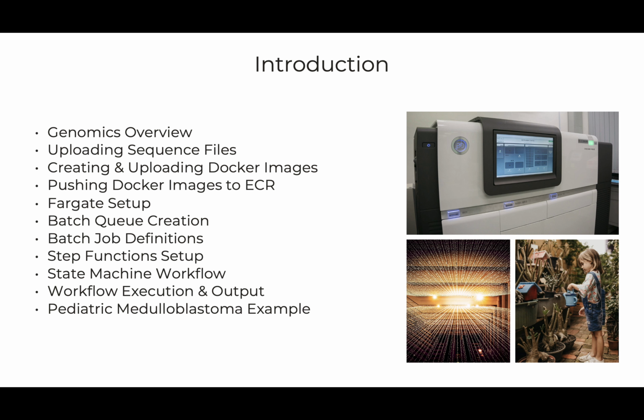These files are vital in analyzing and identifying actionable mutations, enabling the application of therapies targeted at inhibiting these specific mutations. We're living in an era of unprecedented advancements in healthcare and life sciences, where the promise of developing precise patient-specific treatments is not just a dream, but a tangible reality. Let's explore this exciting journey together.